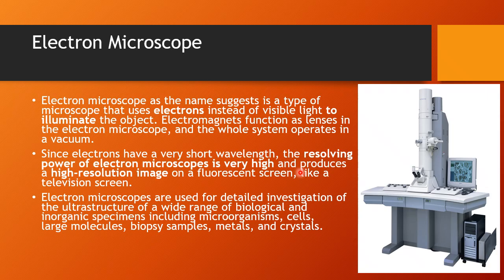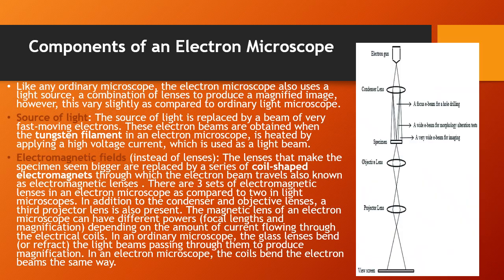We use this microscope to study or investigate the ultrastructure of a wide range of biological and inorganic specimens, which includes microorganisms, cells, large molecules, biopsy samples, metals, and crystals. To study all these, mostly we use this microscope. Okay, so the next topic is the components of the electron microscope.